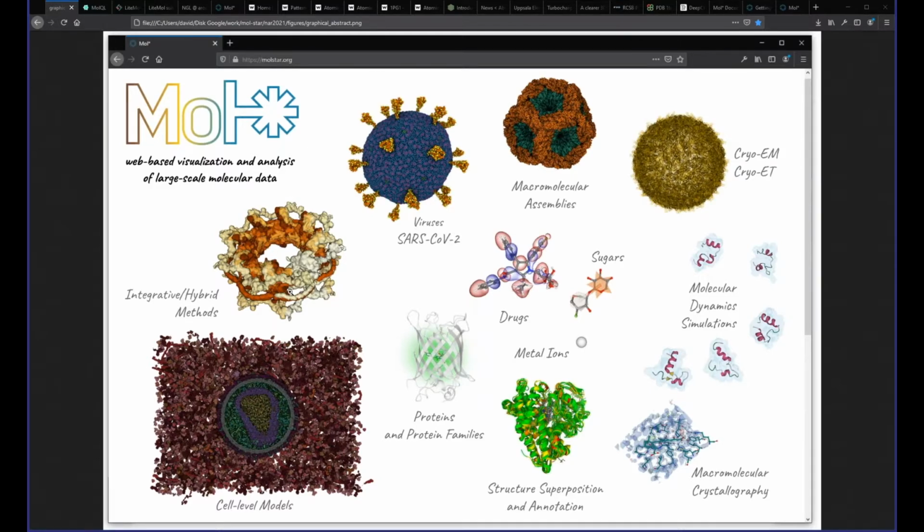When thinking what to talk about, I realized that this didn't happen overnight, and I thought it might be interesting to show what it took to get to developing software like this. To start, where we are now is that this viewer is available directly in the Protein Data Bank.